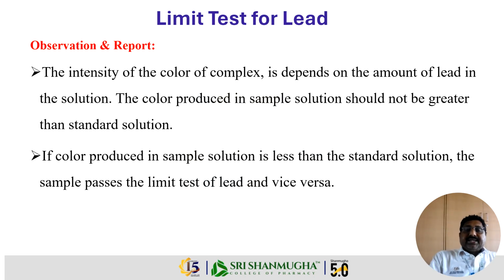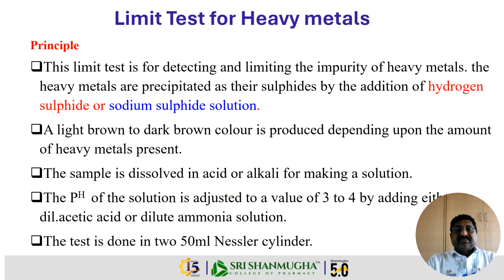If the sample color is darker than standard, the given sample fails. If the sample color is lighter or equal to the standard, the sample passes. Report should state whether the sample passes or fails the limit test for lead. This ensures safety of pharmaceutical substances.